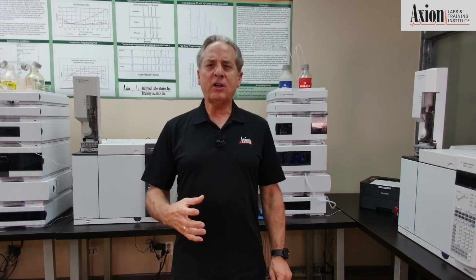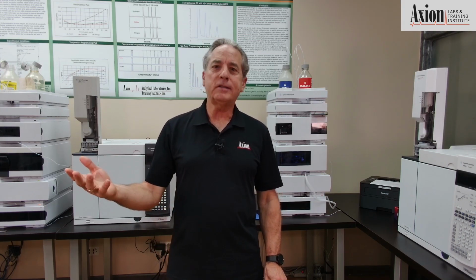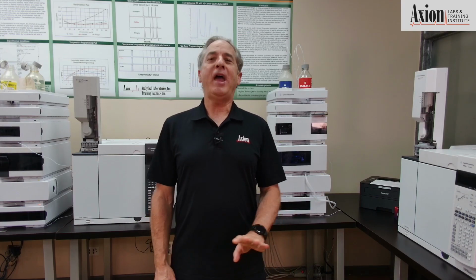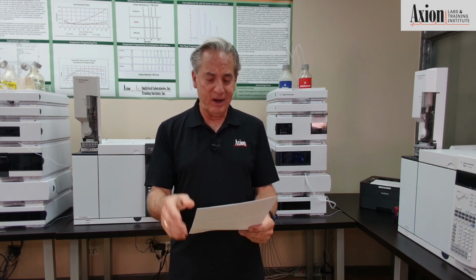So you can't use vial 1, 2, 3, 4, 5, since 1 to 100 are taken. For the front injector, it will be 101 to 108. If you put the tower in the back, it'll be 201 to 208. So that's the secret in finding the right vial number. You can't use 1 through 100 because those numbers are taken, even if you don't have the side tray. So that hopefully will be an easy answer. It costs you no money to fix that one.